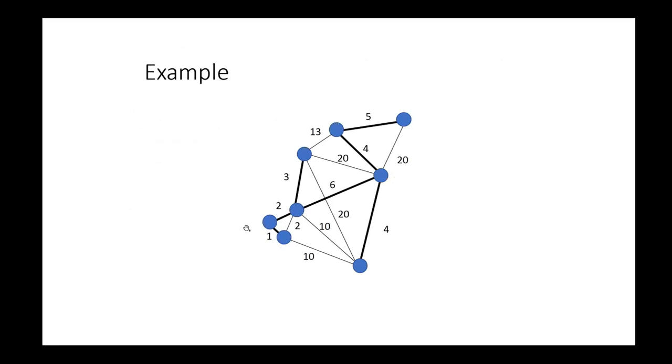and the cells could be linked with a certain weight, such that you then have a knowledge about how close points are. The weight could be, for instance, exactly what we see in an SNN graph, so how many neighbors they share, for instance. Some tools do rely on KNN or SNN graphs. And what you do with a spanning tree is that you find a way in your graph to link all of your points together through a path.